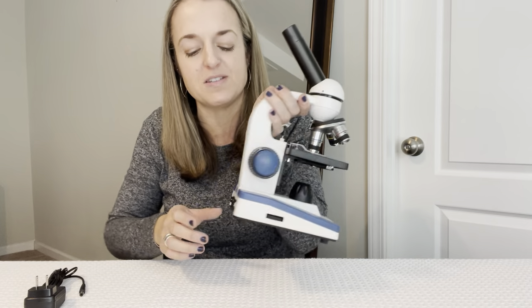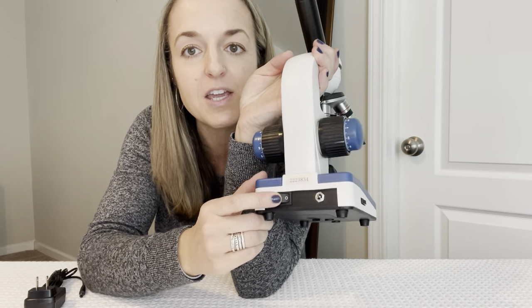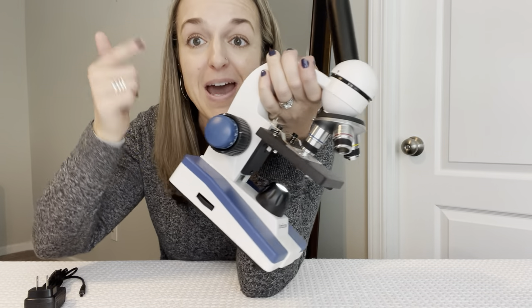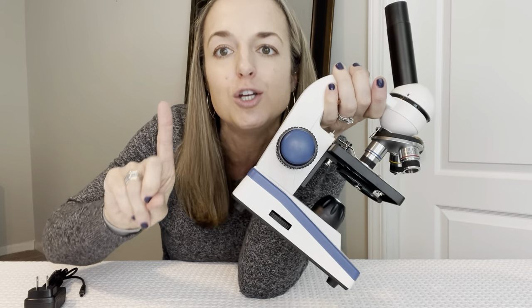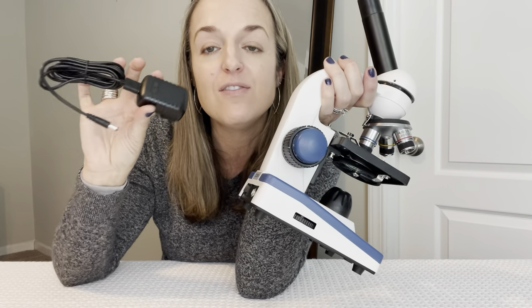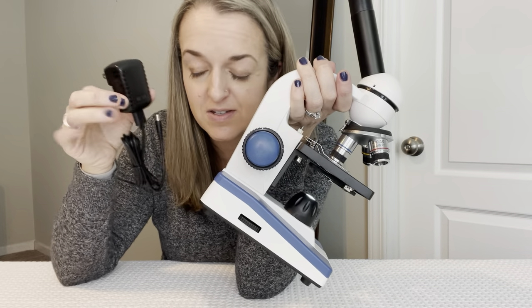Let's check out the microscope itself. The on/off button is back here. You flip it on and, as you'll see, it's not plugged in — this guy is battery operated. It included batteries, or you can plug it in. I love that there are different options for powering this.